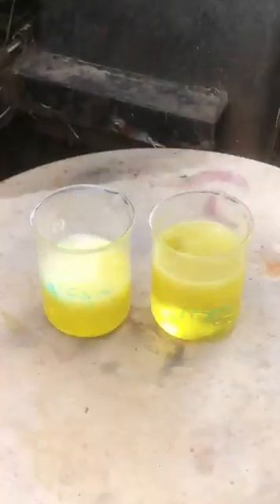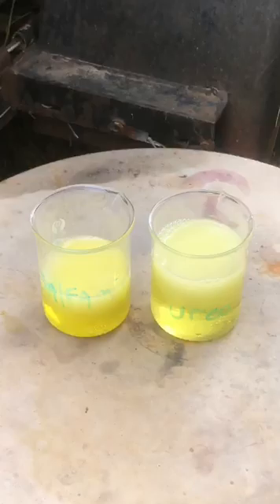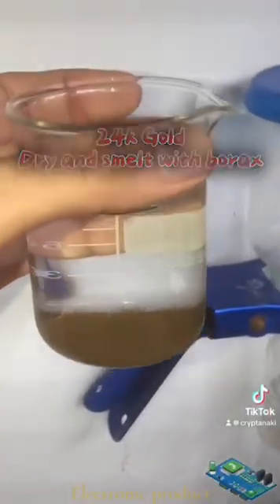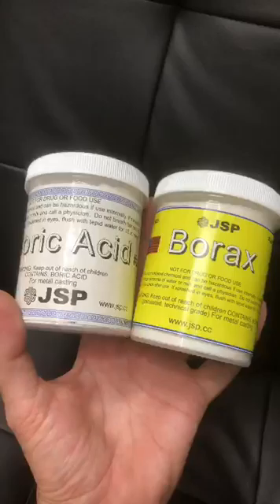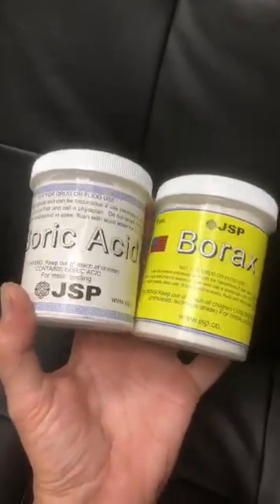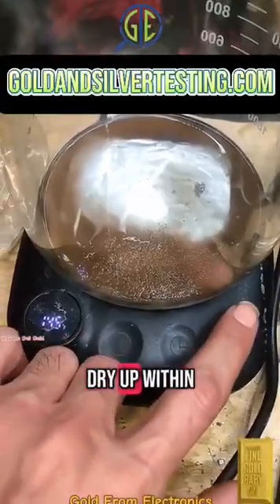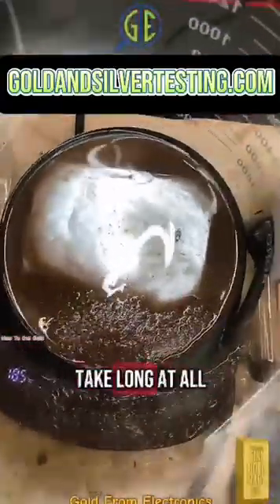Now it's time to precipitate out the gold with some precipitant. Now that we have our 24 karat gold mud, we'll let that dry and then we can go ahead and smelt it down with some borax or some boric acid. You can warm it up in your beaker and it will dry up within about 10 to 15 minutes — doesn't take long at all.